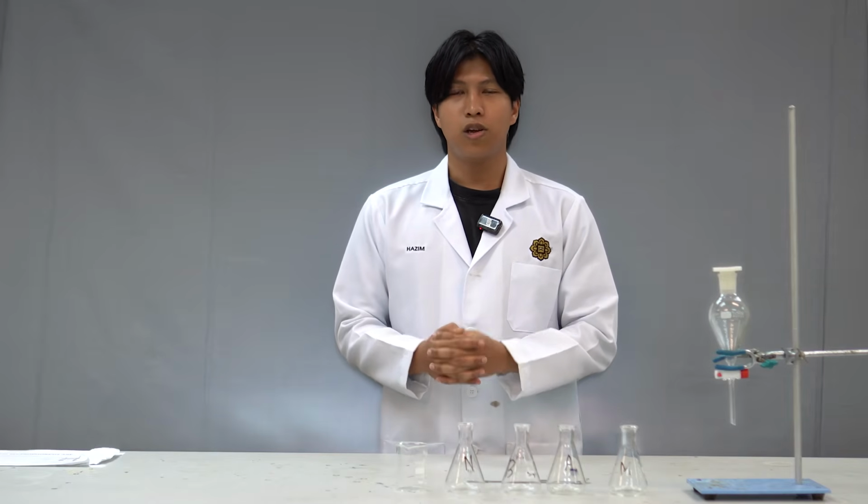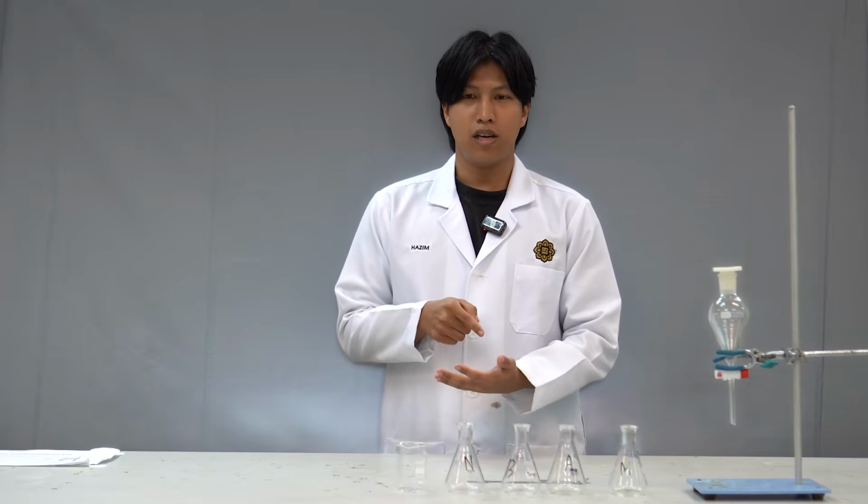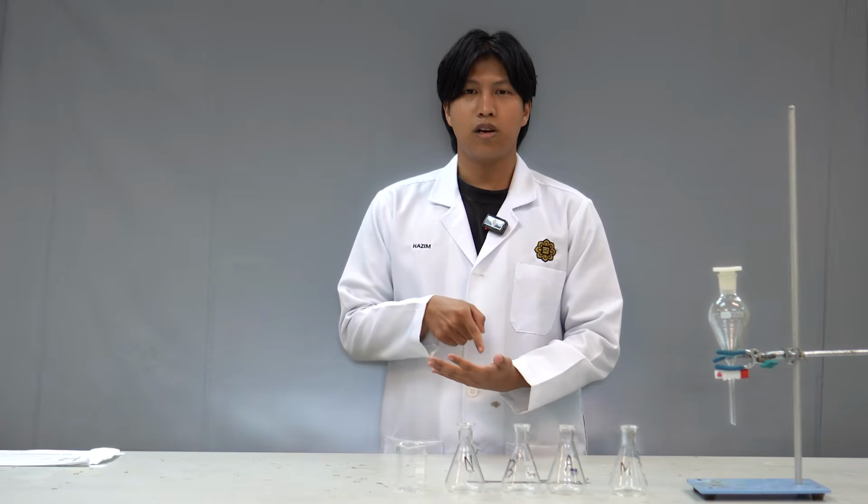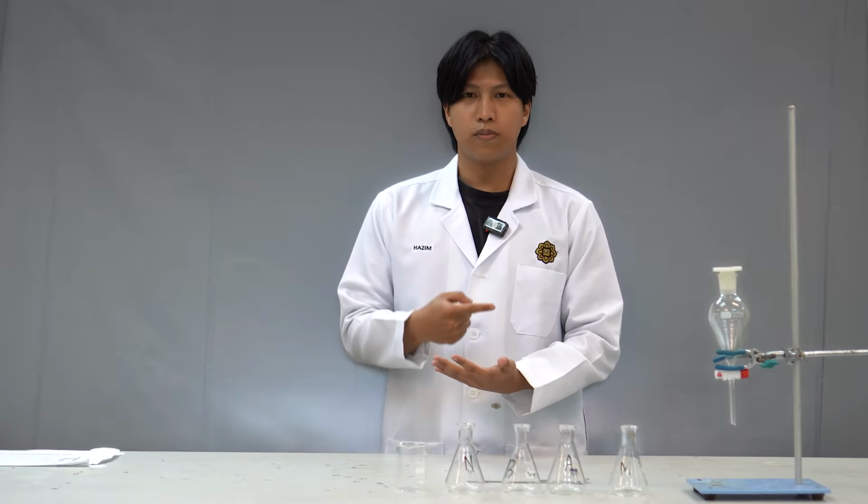So how can liquid extraction be done? Liquid extraction can be done by mixing the aqueous solution with an immiscible solvent that will separate all the organic compound from the aqueous solution. So what kind of immiscible solvent will be used in this experiment?